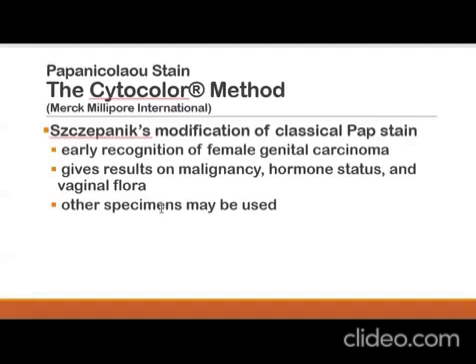Like for example, you want to observe your Lactobacillus acidophilus, your Gardnerella vaginalis. So those are examples of microorganisms that could be present or that you could observe under the Pap smear, after staining it.